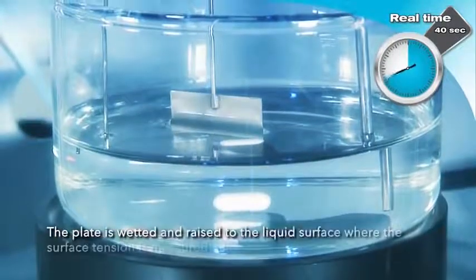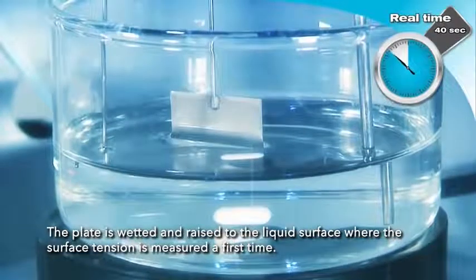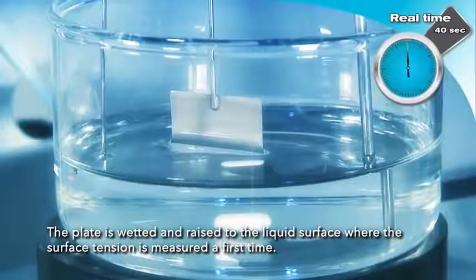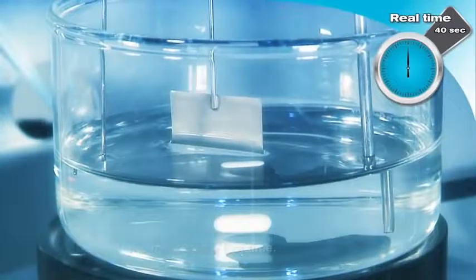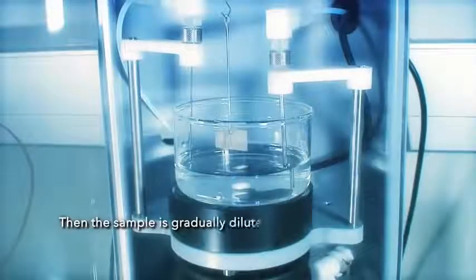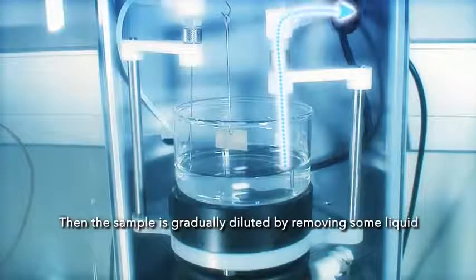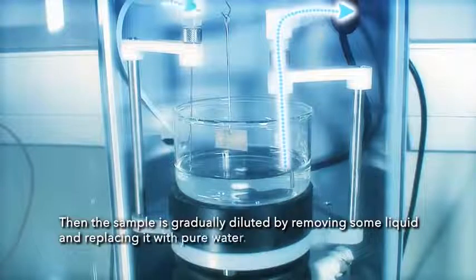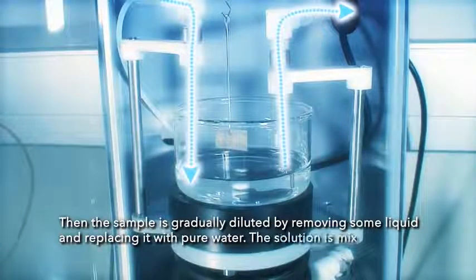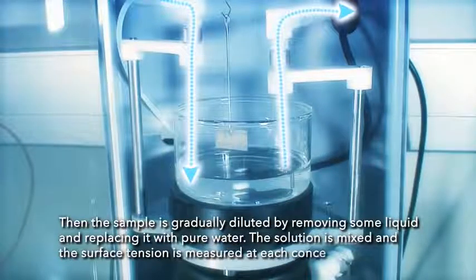The plate is wetted and raised to the liquid surface, where the surface tension is measured a first time. Then the sample is gradually diluted by removing some liquid and replacing it with pure water. The solution is mixed and the surface tension is measured at each concentration.